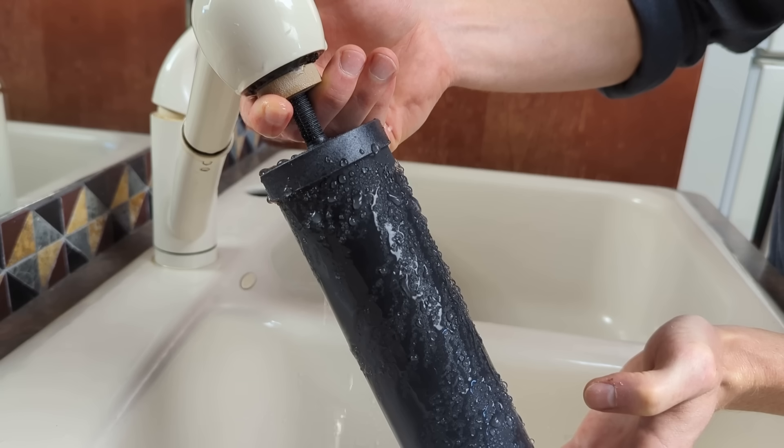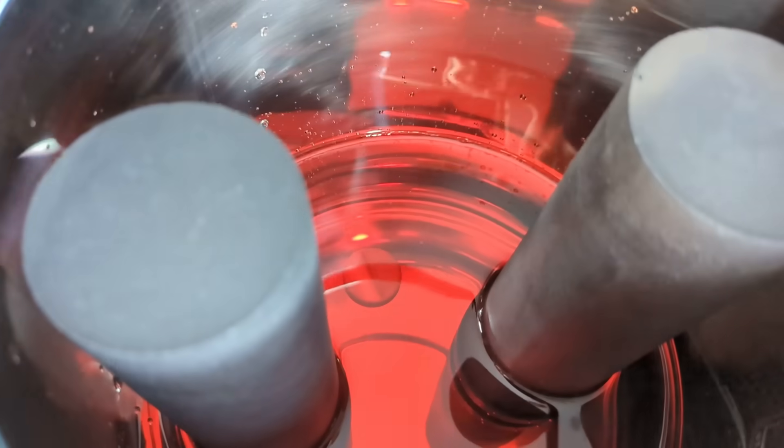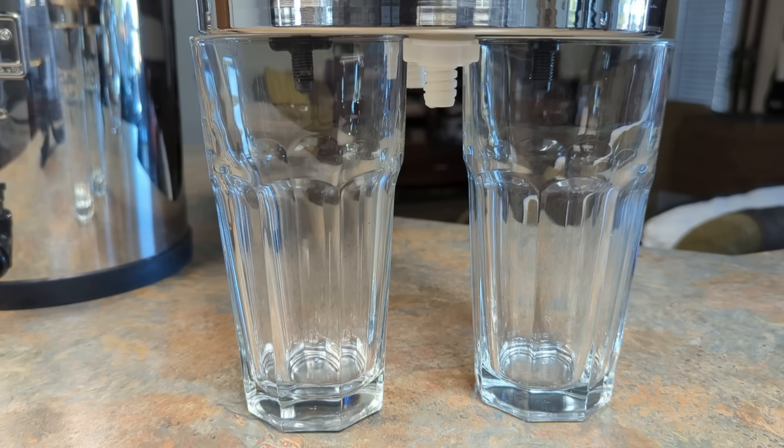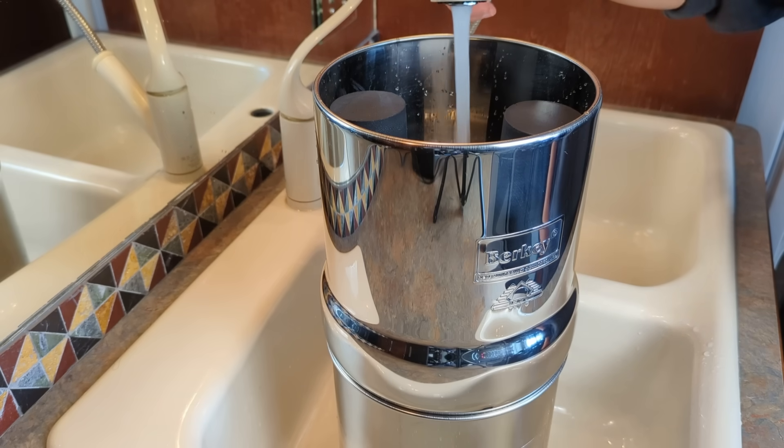Before starting the project, we primed all the filters following Berkey's instructions, installed them, and performed a red dye test to ensure the system was filtering correctly. Finally, we ran about 50 gallons of water through the system before conducting our tests.